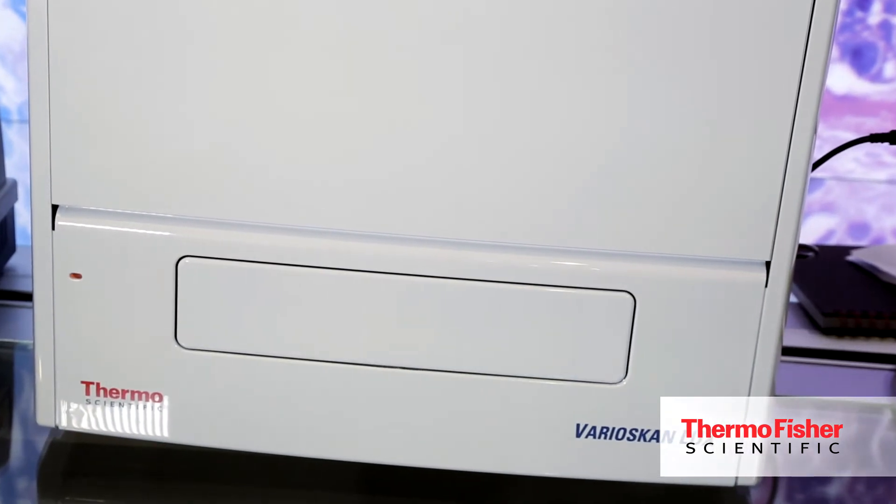The Thermo Scientific Varioskan LUX is a great multi-mode reader because it has five measurement technologies. It's upgradeable to meet the changing needs of your lab and it's really easy to use with the new SkanIt 4.0 software. You can learn more at thermoscientific.com/varioskanlux.